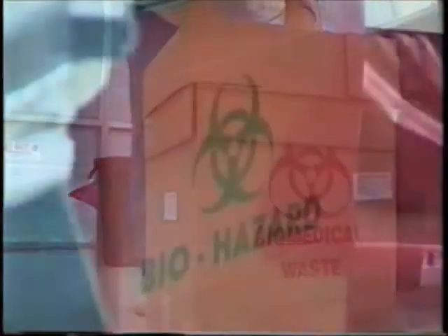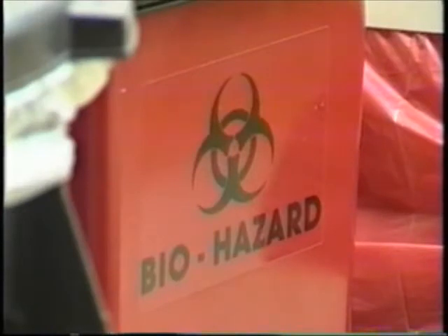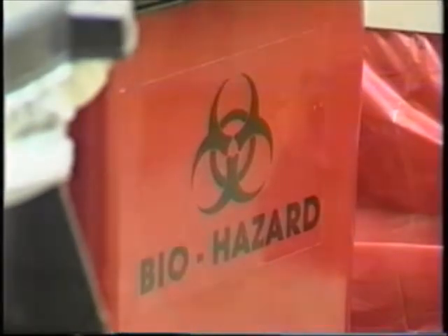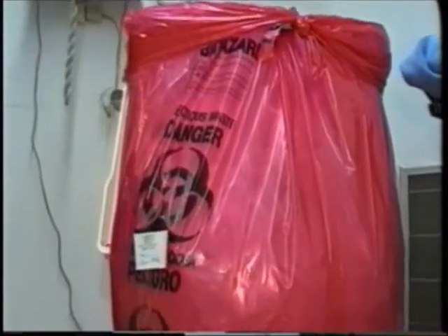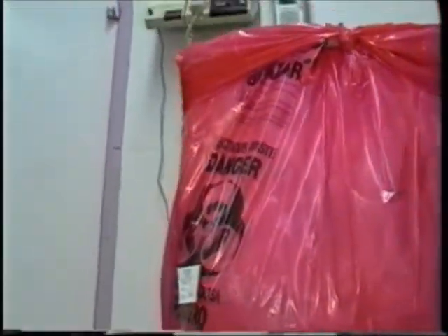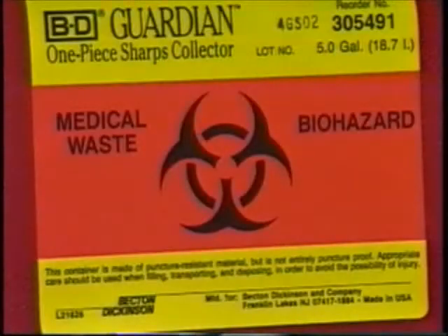The International Biological Hazard symbol in either red, orange, or black with a contrasting background color must appear on the outside of bags, containers, and sharps containers. The symbol needs to have one of the following phrases with it: biomedical waste, biohazardous waste, biohazard, infectious waste, or infectious substance. The presence of the symbol and phrase point out the potential danger to anyone who comes into contact with the contents.